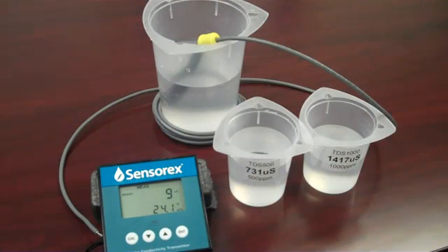For best results, select the conductivity standard solution that is close to the sample value you expect to measure. If you'll be measuring over a large range, select a standard that's about 65% of your full scale range. For our example today, we will perform a single point calibration.